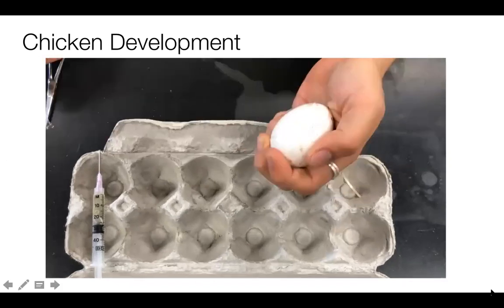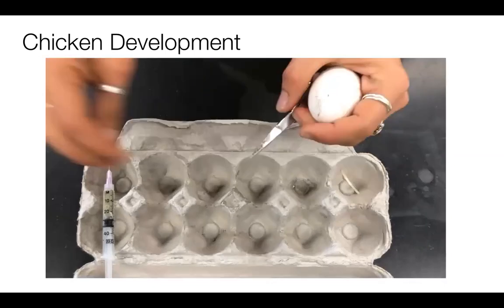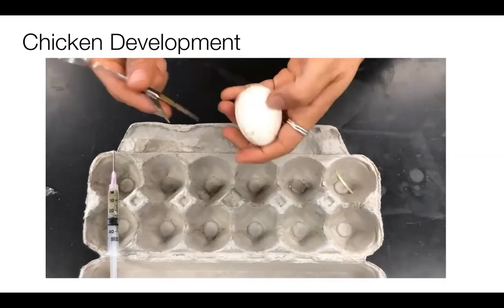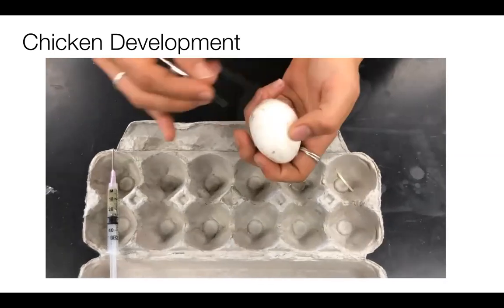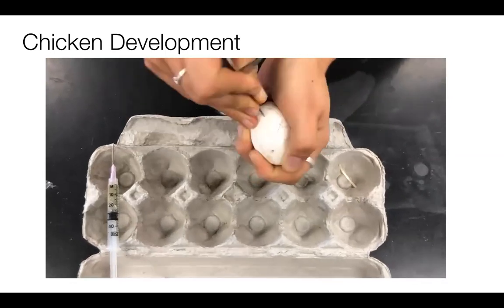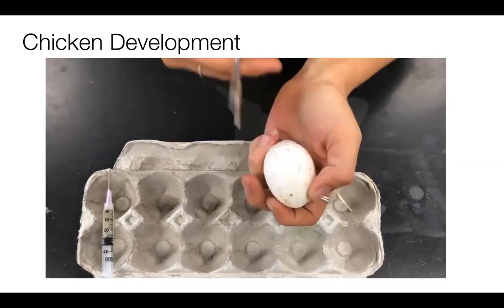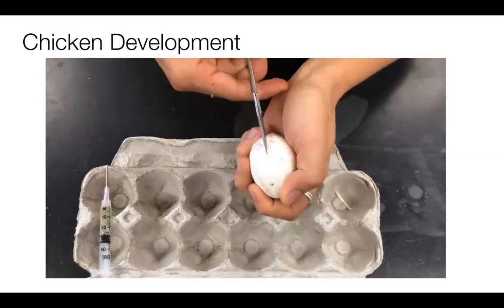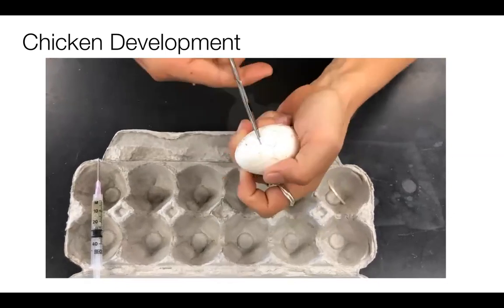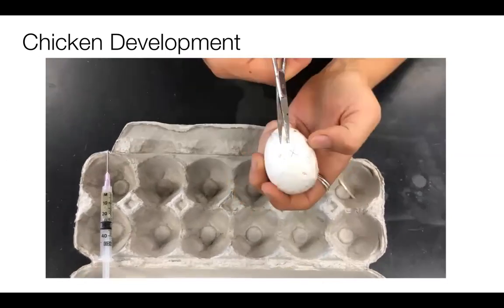After that, we can start cutting our window into our egg. I use the same technique as I drilled the hole in. You're going to take your scissors and again drill one hole in to start the window. Take one edge of the scissors, same pressure, and then you are into the egg. Then you can just slide the scissors under and start cutting a window. About an inch window will help you see the embryo the best. So I'll just keep cutting. Remember, we just took some liquid out, so there is an air bubble in there.